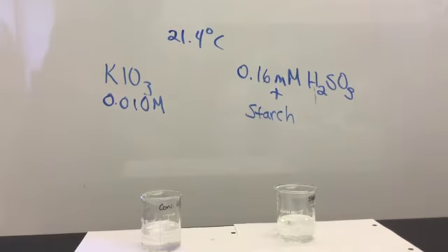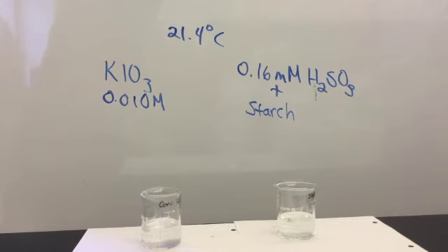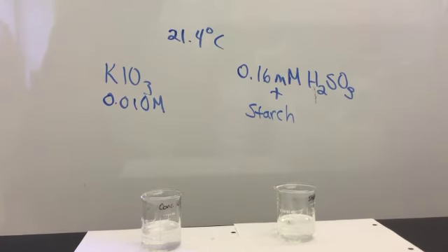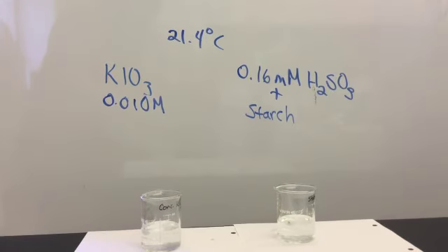Now we'll look at a reaction with a more concentrated version of the potassium iodate. In this case, the concentration of the potassium iodate is 0.010 molar, or not quite double our original concentration. Again, still working at room temperature.